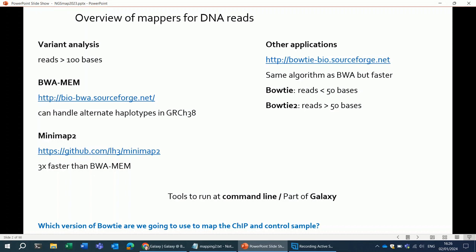So what is different from BLAST? Well, BLAST will map sequences to a whole database of sequences. And here in BWA-MEM and also in Bowtie, you are going to map your reads against this huge genome sequence. So you use exactly the same algorithm as BLAST, but it's a different thing that you map to. Instead of a database of sequences, you map to the genome sequence.